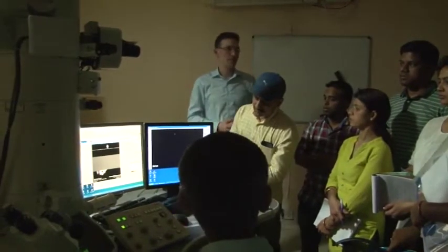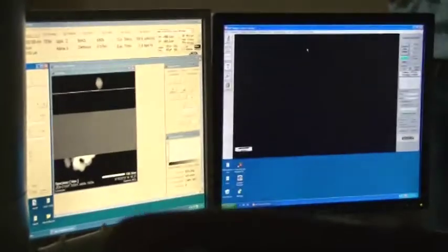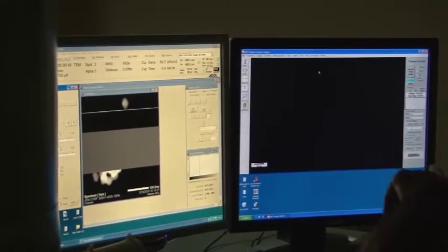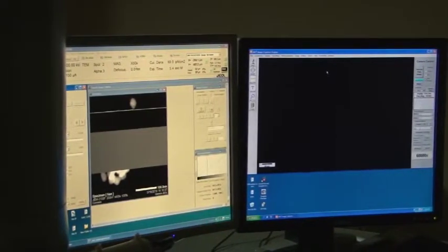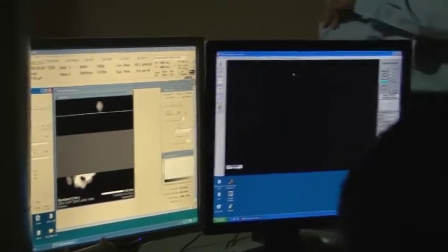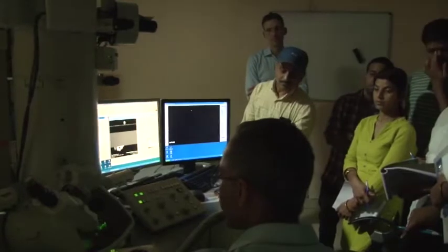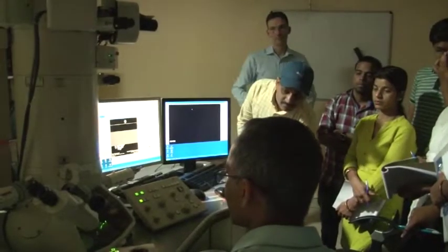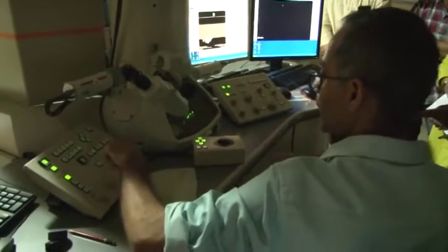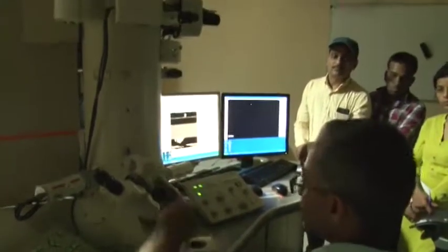Okay. Then the second step we said is aligning the condenser aperture. That is a little difficult to show on the CCD screen, but there is no finer detail to be seen, so you can all see it from where you are. So what I am going to do is focus the beam. It is the same knob as brightness. Right now we are playing only with the condenser.